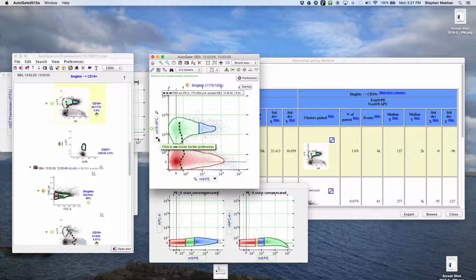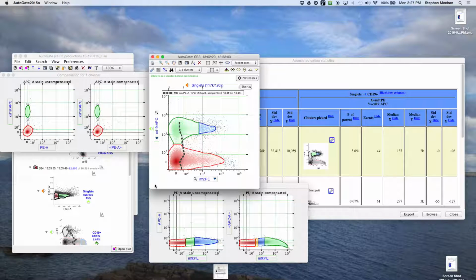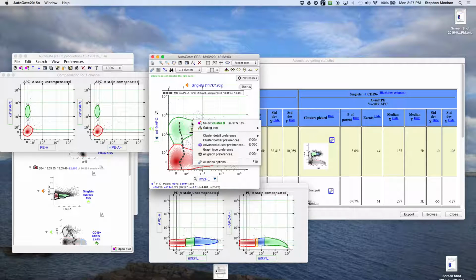One other thing I wanted to show you is the all marker expression monitoring that you can do as you work on the projection pursuit plot editor window. And to do that, you basically right click.